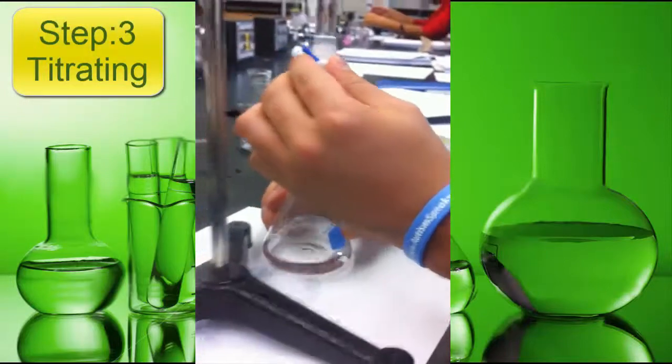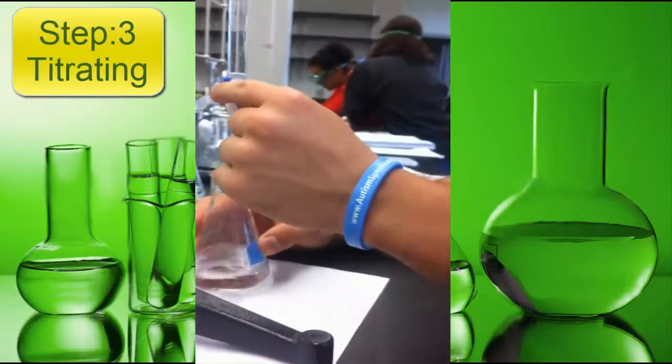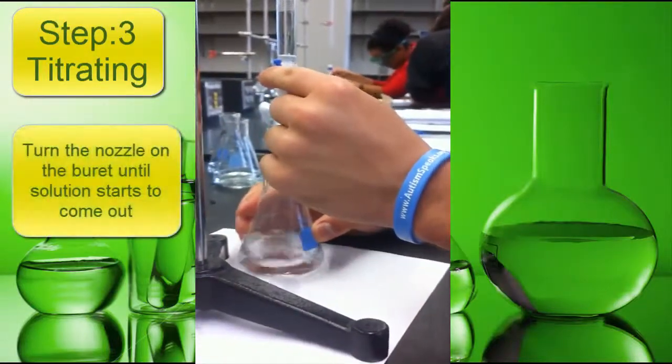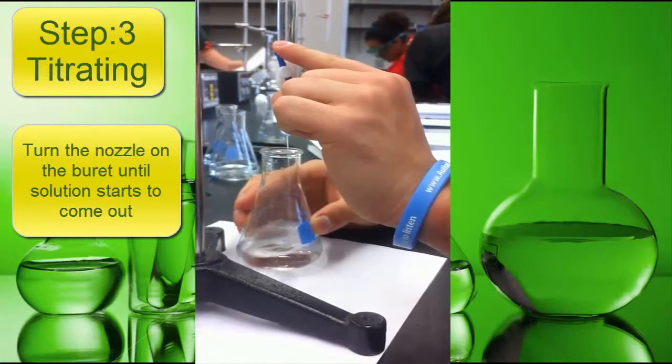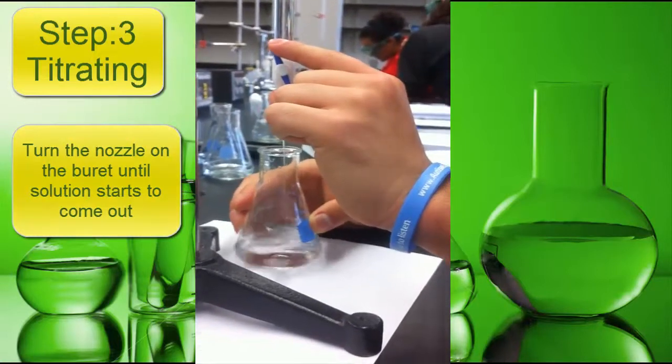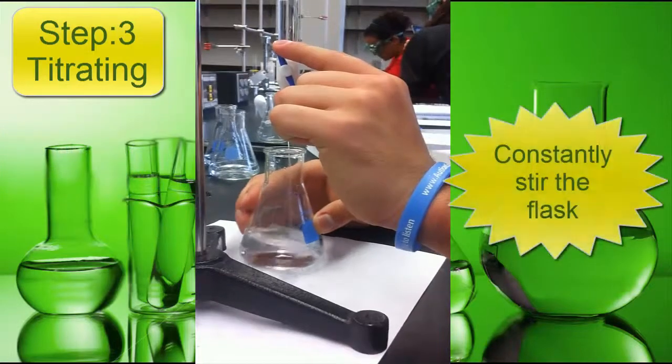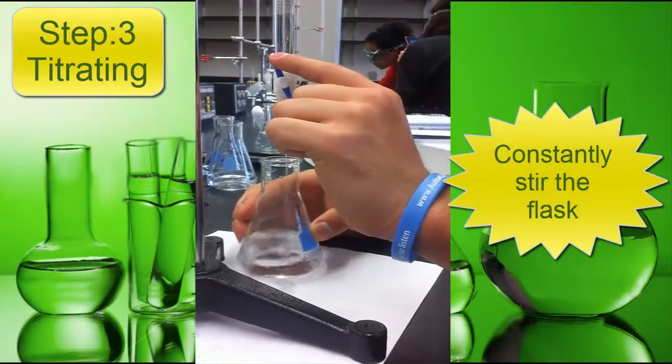Step 3: Titrating. Turn the nozzle on the burette until the solution starts to come out. Constantly stir or swirl the flask.